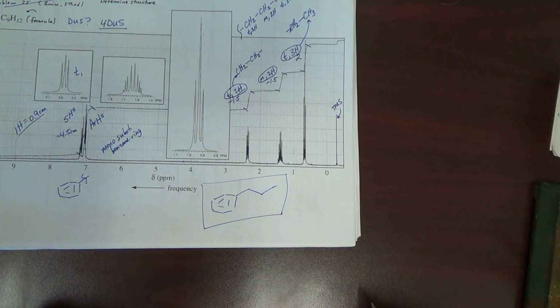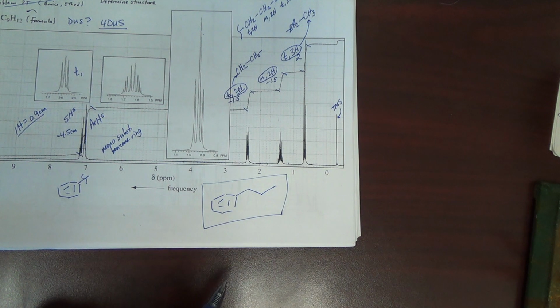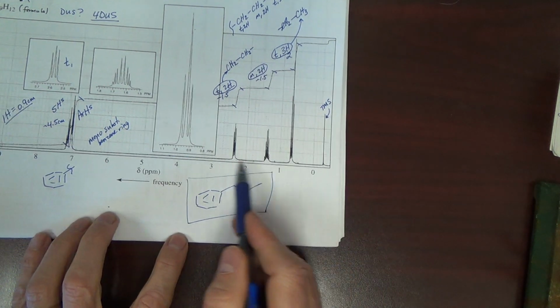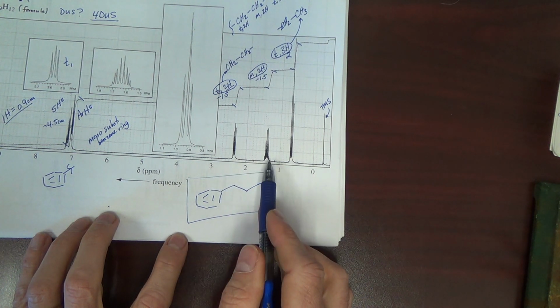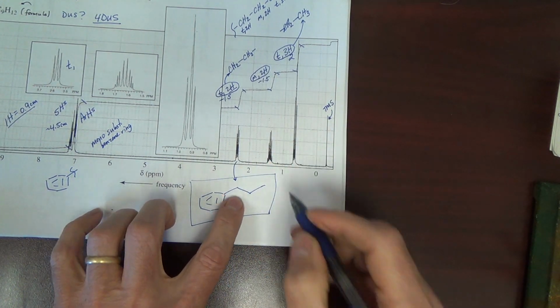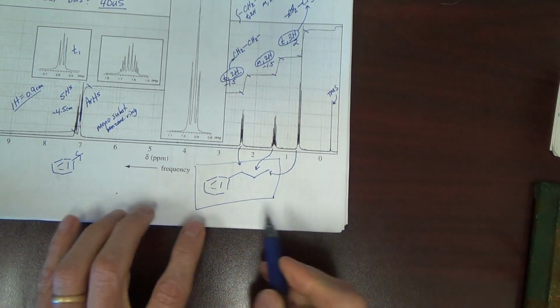What else could it be? It's actually a pretty introductory NMR problem. We use splitting. We really didn't use peak position. I mean, they're all saturated. We were working in the saturated CH region. This signal is for these H's here, there, and there.